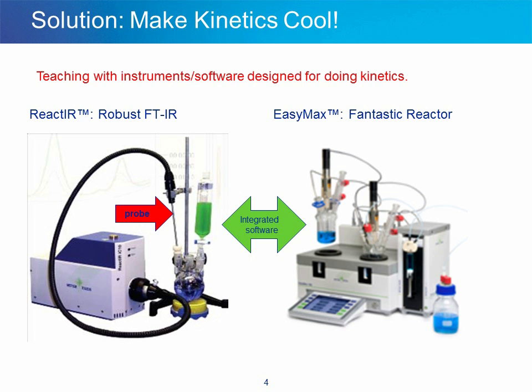In this slide, I would like to describe my approach to the kinetic experimentation problem in academic settings. My approach, in fact, I think it's my solution, is to make kinetics cool. The way you make kinetics cool is you do teaching with instruments and software that are designed for doing kinetics.